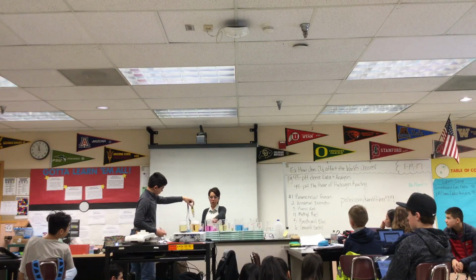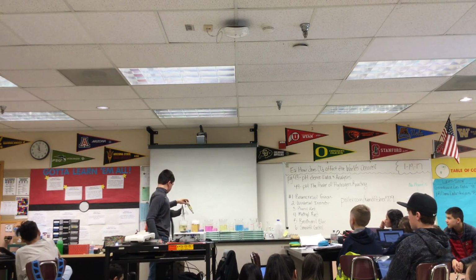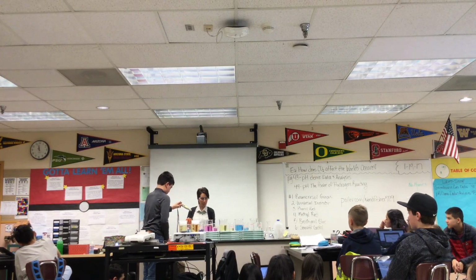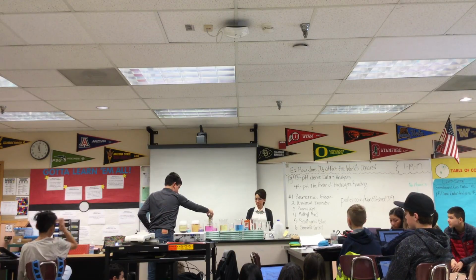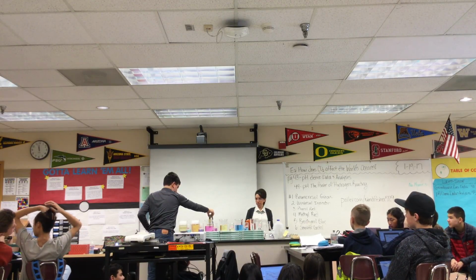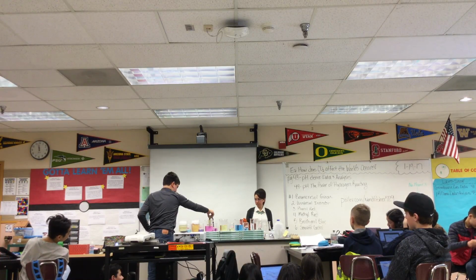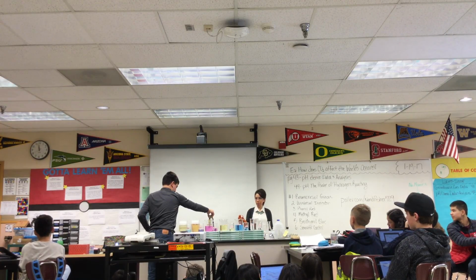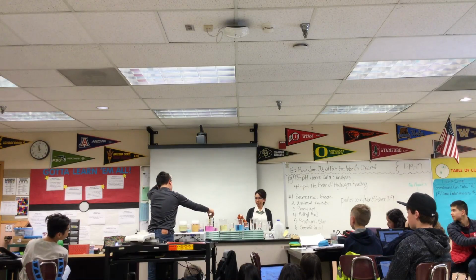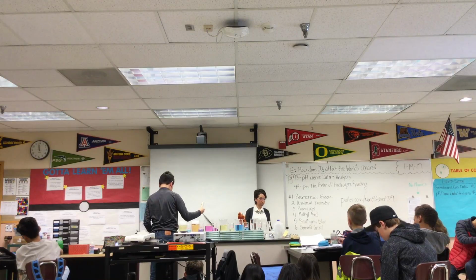All right, you're good. Do you want to go ahead and do phenol red though? There you go. Test our phenol red for our initial pH. You can always round it. About 9.3. About 9.3 for phenol red.